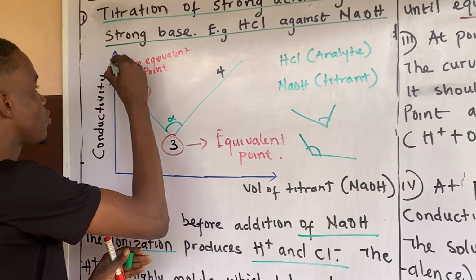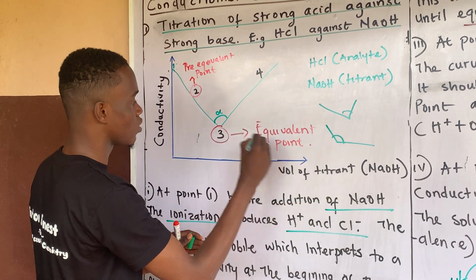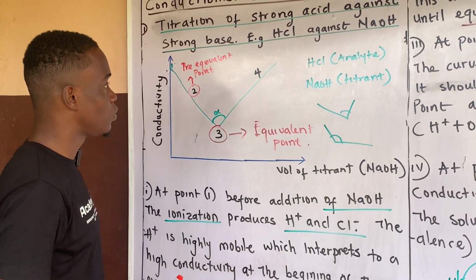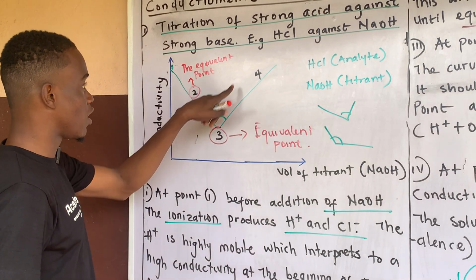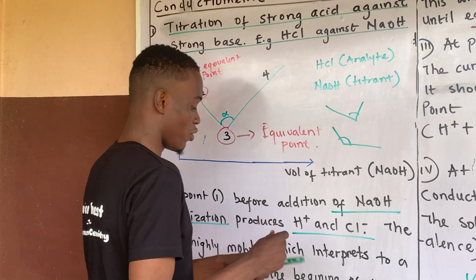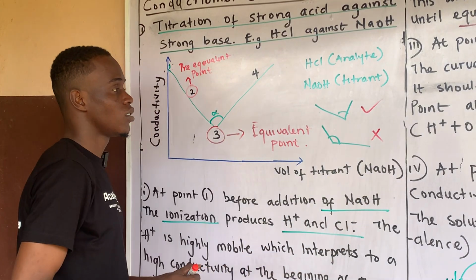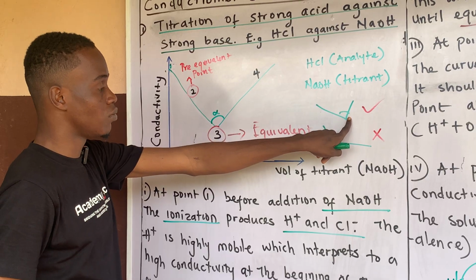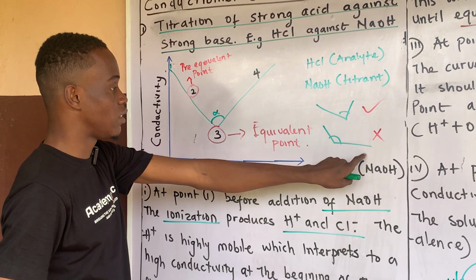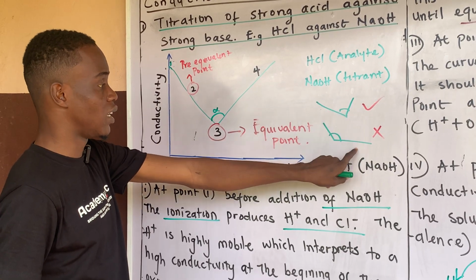So if this graph gives an obtuse shape compared to this, for a strong acid strong base, it tells you that this is more correct than this. A person having this shape is more accurate than the person having this, giving less error for the titration than this.